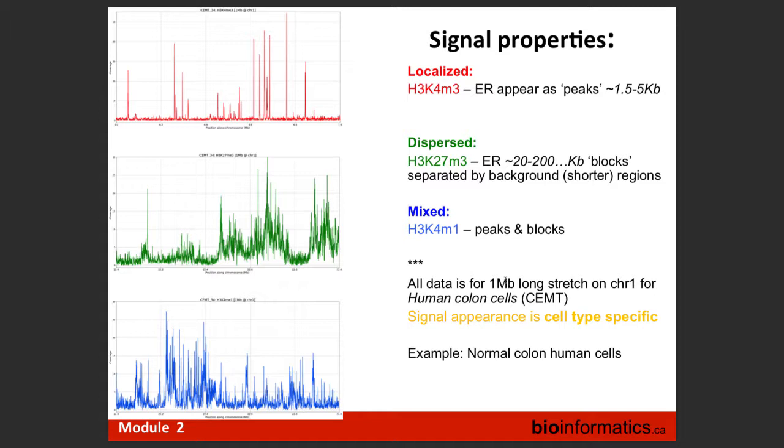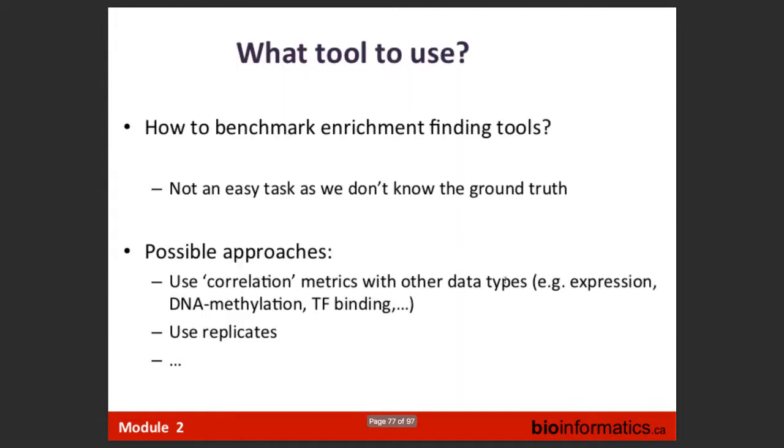However, biologically, maybe we have a single scale. And this is for you to think about. It's homework. I'm thinking about this. We're all thinking about this. What is the actual scale of the histone modification? When we have an enzyme which is a writer of histone modification, how many juxtaposed nucleosomes can it affect? It can't affect half a megabase, that's for sure. So it probably affects several. And what is happening here is just spreading of the mark. But it is consistently happening for millions and millions of cells. So what tool to use?